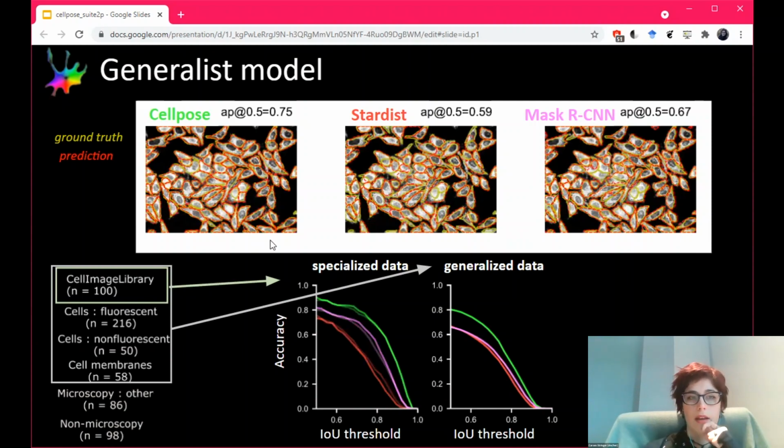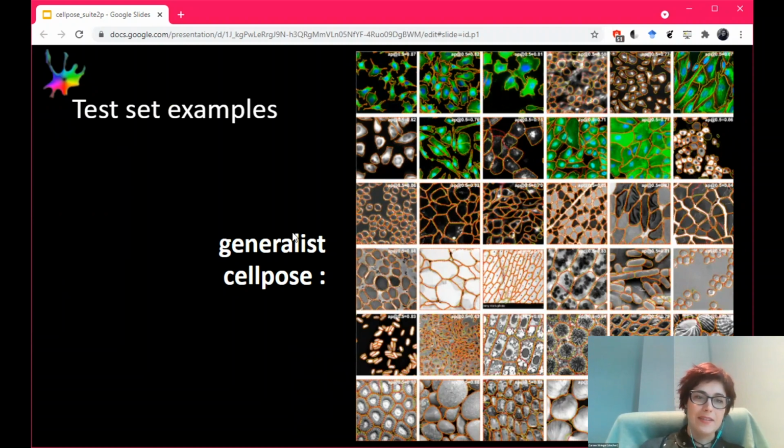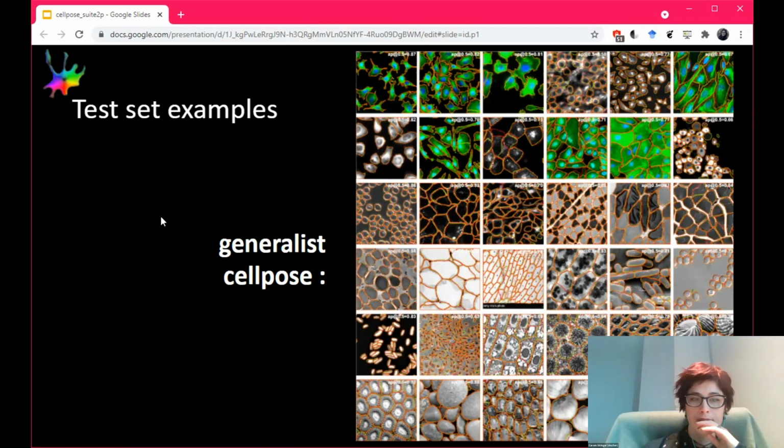So yeah, I think for a first pass you can do a good job with an automated algorithm like this that doesn't take into account overlaps, and then you might want to manually curate some of the overlaps if you need to. Yeah, it's actually impossible to always get overlap right. There usually isn't enough information in the image. Yeah, I think this is amazing. Thanks. Without 3D information, it can be really difficult.